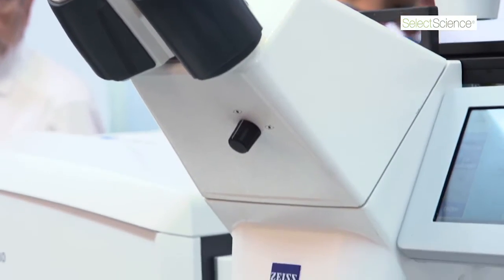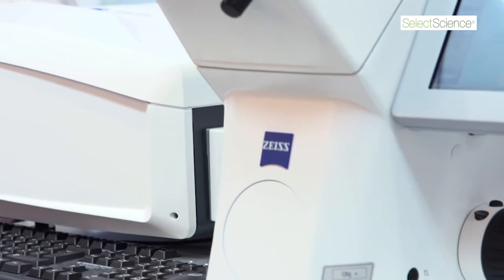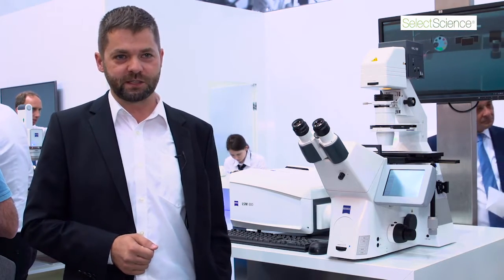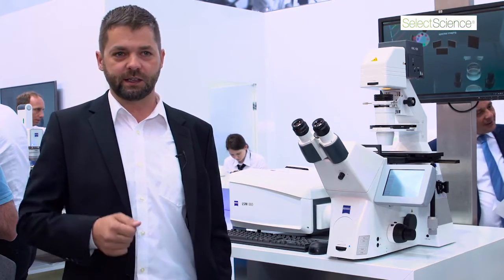Traditionally, fluorescence microscopes were divided into two different groups. Widefield microscopes on one side produce images very fast, with very little damage to the specimen. Confocal microscopes, on the other hand, work very well with thicker specimens and produce very high resolution images with high contrast.